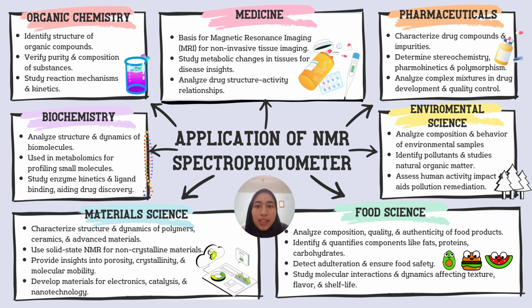In material science, NMR characterizes the structure and dynamics of polymers, ceramics, and other materials at the molecular level. Solid-state NMR is particularly useful for non-crystalline materials, providing insight into properties like porosity, crystallinity, and molecular mobility. This is essential for developing materials with specific properties for applications in electronics, catalysis, and nanotechnology.